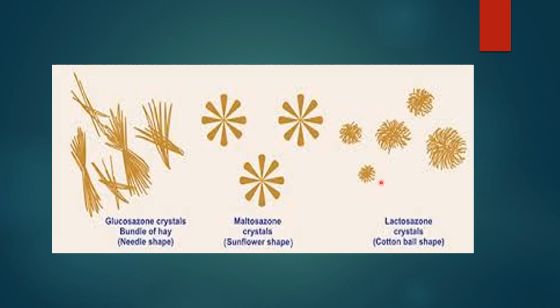As you know, this is lactosazone, which comes from lactose with the reagent. The crystals are like the cotton ball shape.